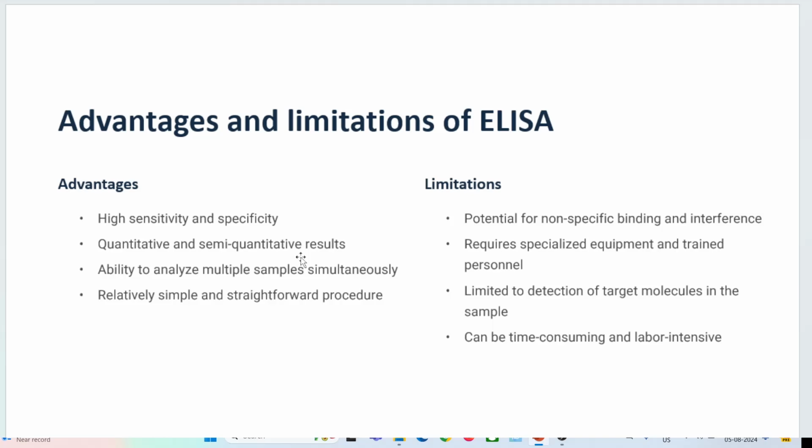So what are the advantages of ELISA? It is a very high sensitivity test, and we can diagnose a majority of diseases with an ELISA kit. Multiple samples can be analyzed in ELISA, and it is very simple and straightforward.